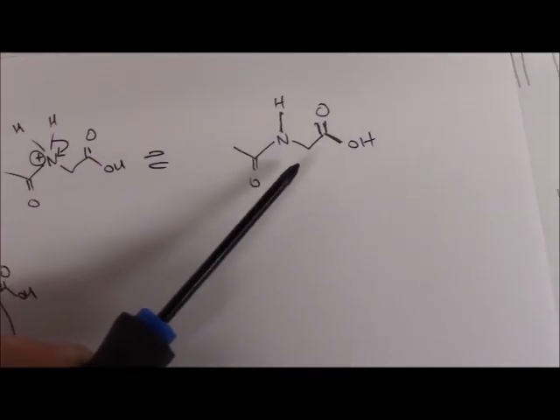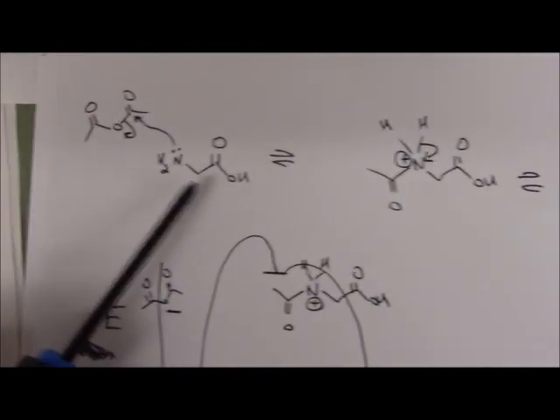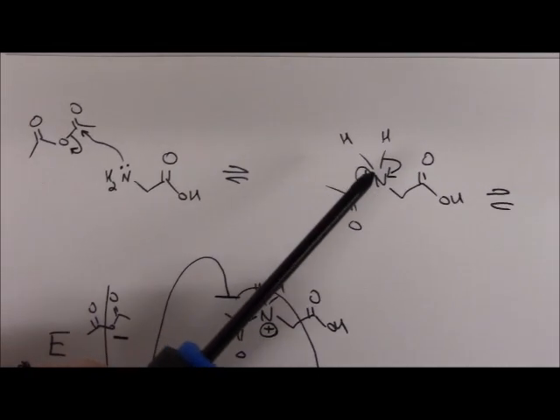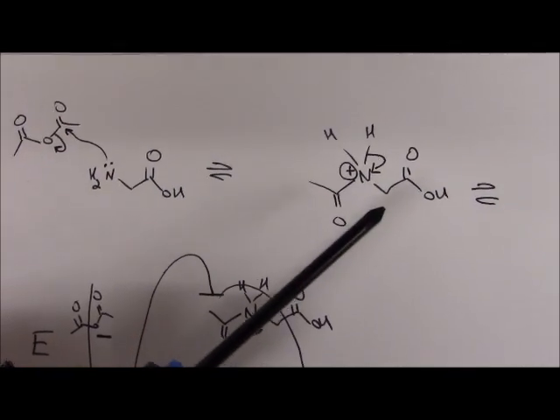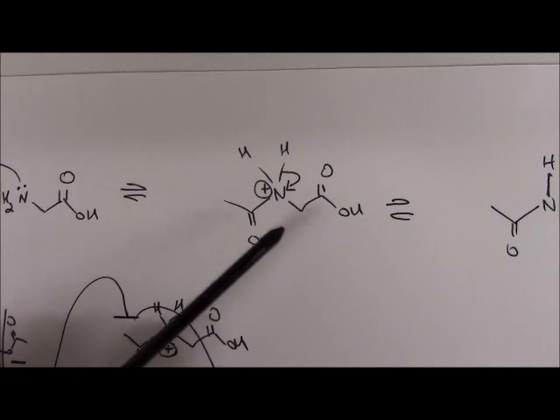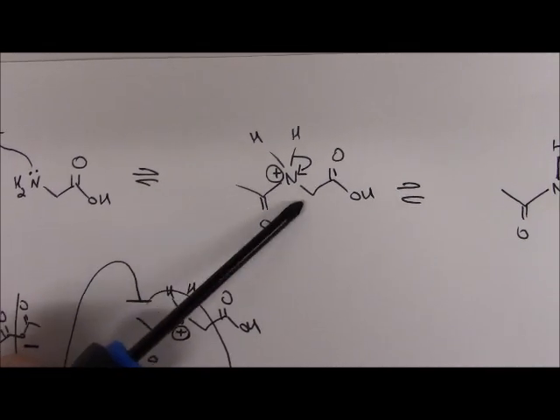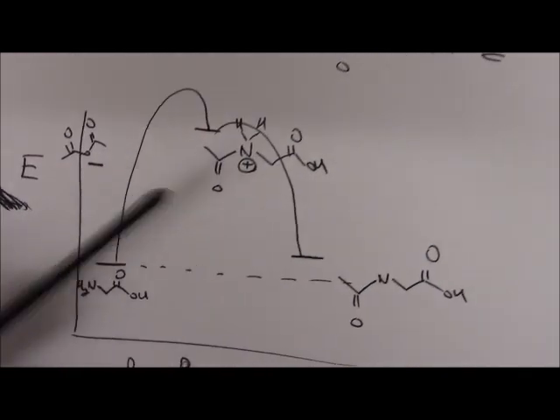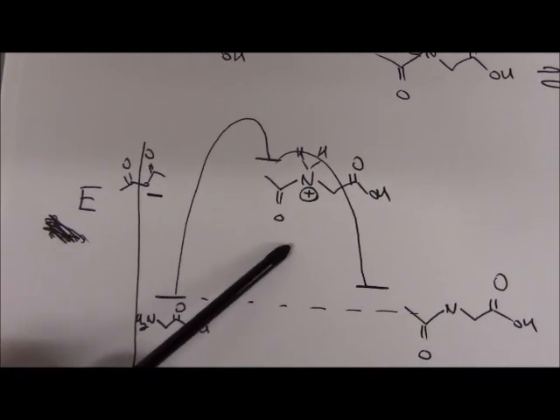The other observation is, you know that your starting material and your final product are white crystalline powders. So you start in your flask with a white powder, then all of a sudden, if you're paying attention, it gets warmer, and you'll also see it goes kind of clear. So obviously there's something that has a solubility in the water or aqueous solution you have, which proves this intermediate very likely to be there. And then as it proceeds to make your final product, you get the white solid coming out because it is not soluble in water. So that kind of fits with the mechanism in this reaction diagram.